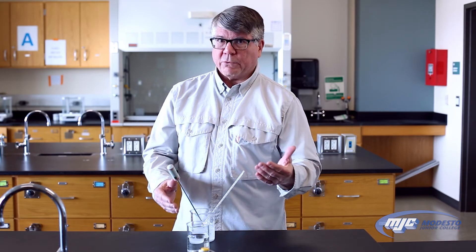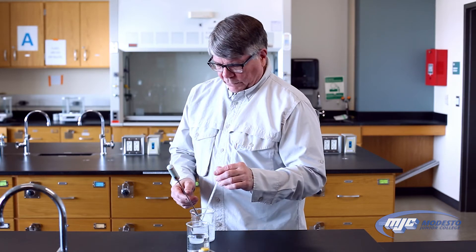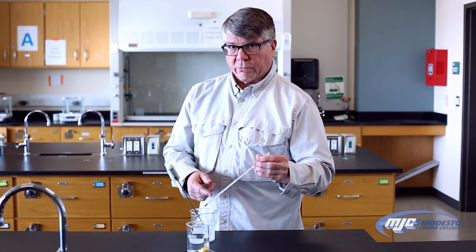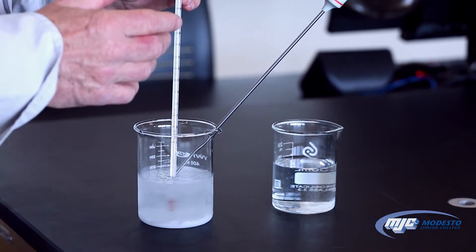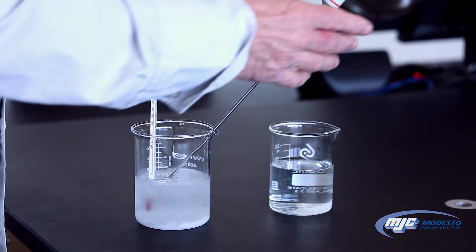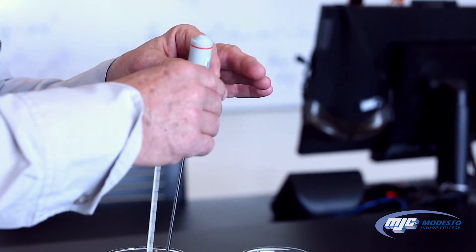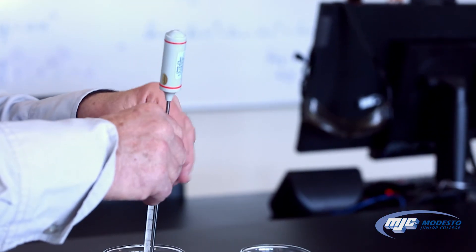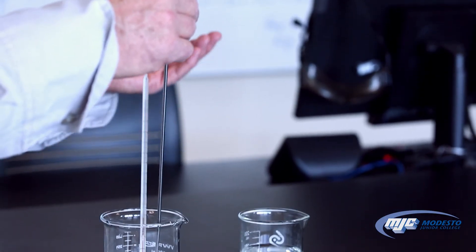When we're taking the temperature of anything with these thermometers, one thing we want to be sure of is that the tip of the thermometer that's reading the temperature is submerged completely, but not touching the bottom or the sides of the container. Likewise with the digital thermometer, you want to make sure you're holding it on the plastic part up here, not down on the metal part, and the tip is submerged, not touching the bottom or the sides.